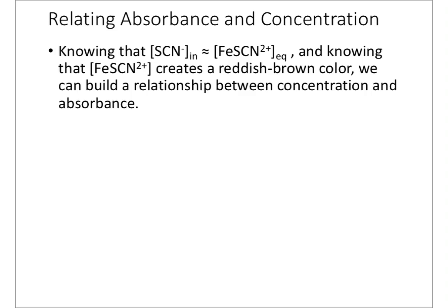Now, once we have this equilibrium number for the concentration, what we can then do is take this known concentration and put it into a spectrophotometer. Now, you've already used a spectrophotometer in the first semester lab when you were looking at Kool-Aid concentrations and their color. And what you might remember is that at a low concentration, you had a pretty lightly colored solution, but at higher concentrations, your solution got darker.